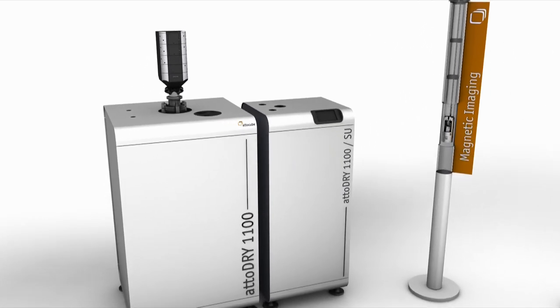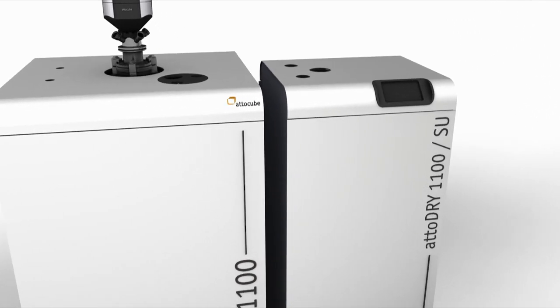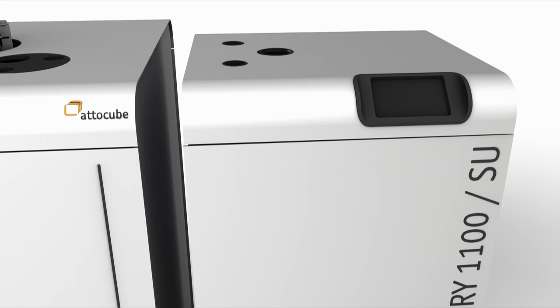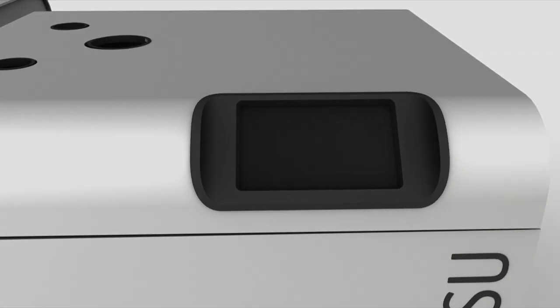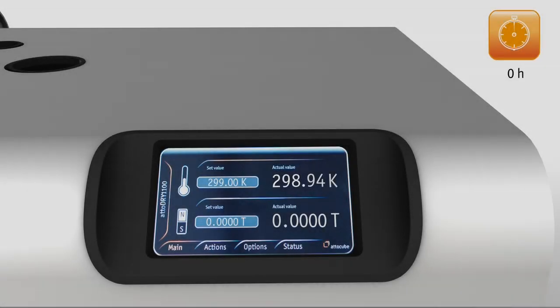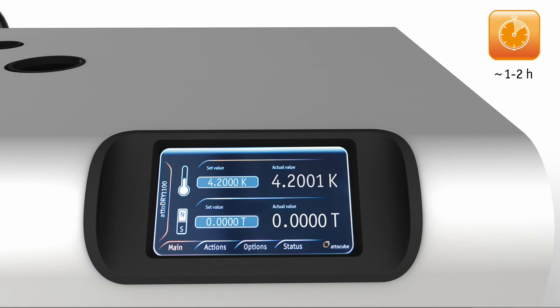With the brand-new AttoDryLab, AttoCube provides the perfect 21st-century nano-characterization platform. The performance of the cryostats is simply outstanding. Cooling down a microscope after sample exchange takes only one to two hours.